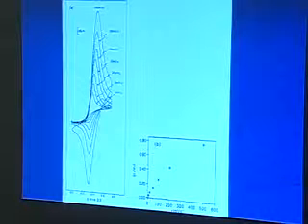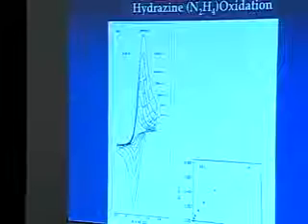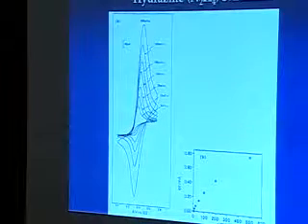So again, there is always, in the real world, some sufficiently fast scan rate where these peak currents get large enough that i times R is a number that comes into play, and you see some peak-to-peak separation. And this particular system is rather resistive, actually.